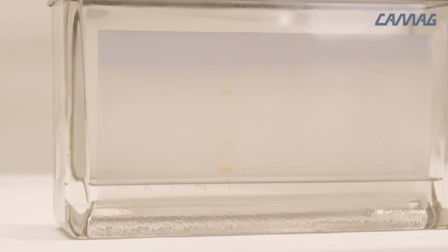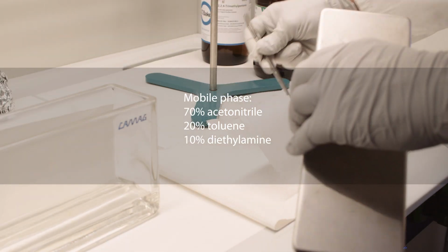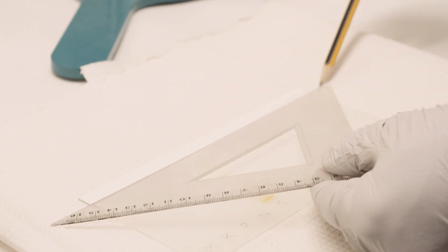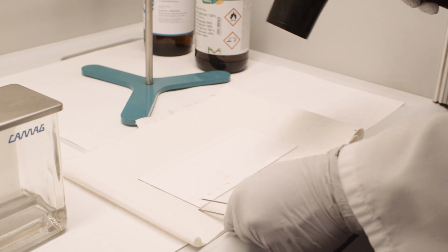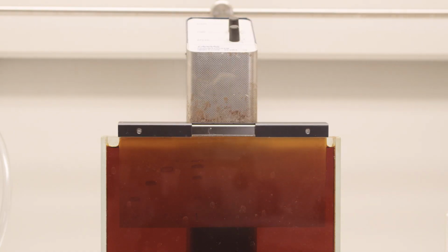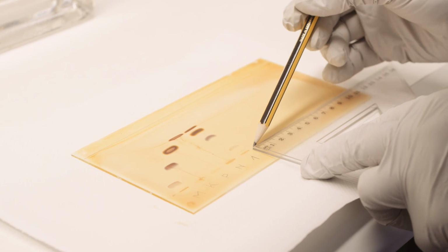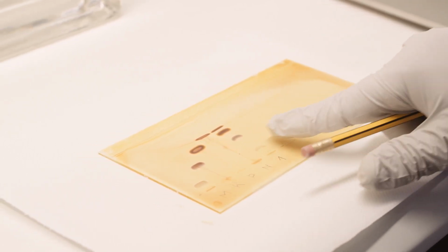The mobile phase consists of ethyl acetate, toluene and diethylamine. When the mobile phase reaches the upper edge, mark the front and dry the plate. Make the alkaloids on the plate visible by immersing the plate in a solution of potassium bismuth iodide called Dragendorff reagent. It colors tertiary amines red. Alkaloids are tertiary amines due to the amine group and will stain. After staining, the plate is dried.